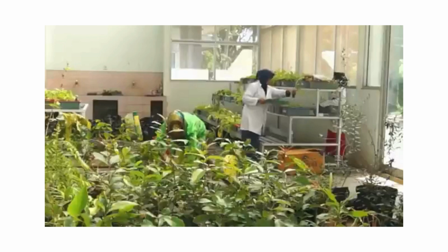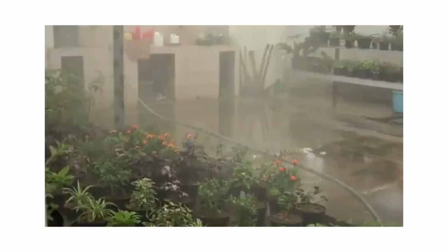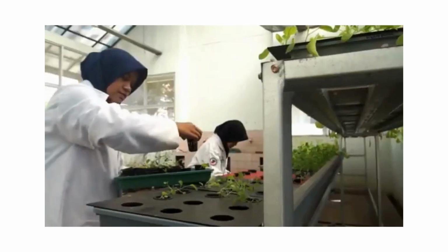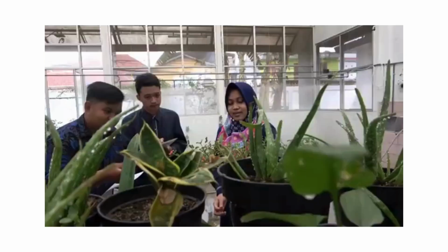Greenhouse. The greenhouse is one of the outdoor supporting facilities for practicum and research based on plant cultivation. This supportive facility is located outside of the biology study program building but is still within the scope of the area. It can accommodate 40 to 50 students.